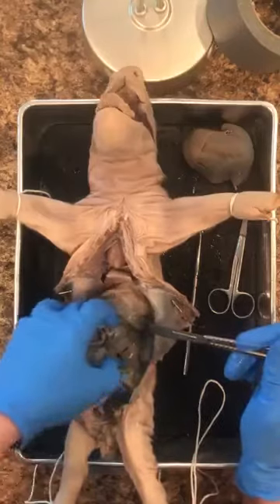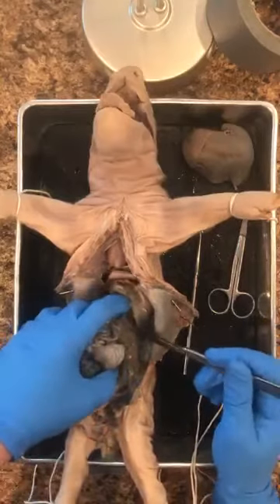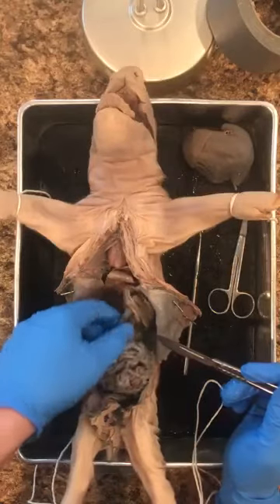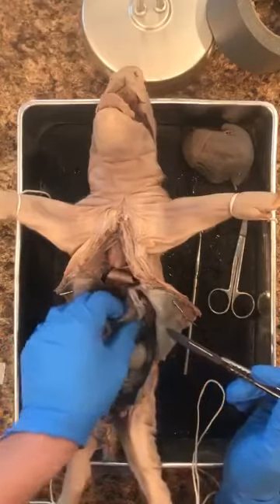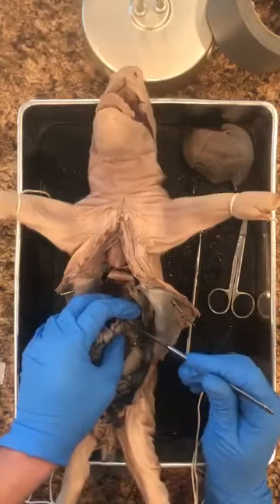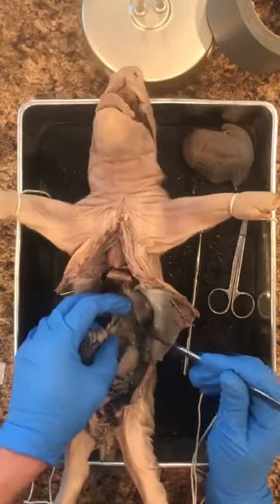The intestines literally take up all of the space, which you will see when I unravel them. I'm going to unravel them off camera because it takes a while.